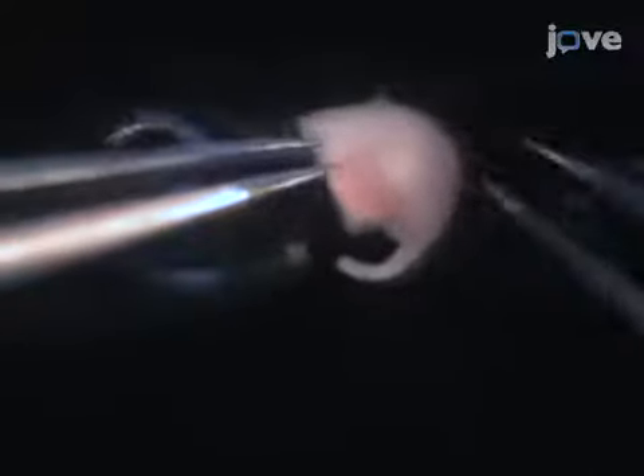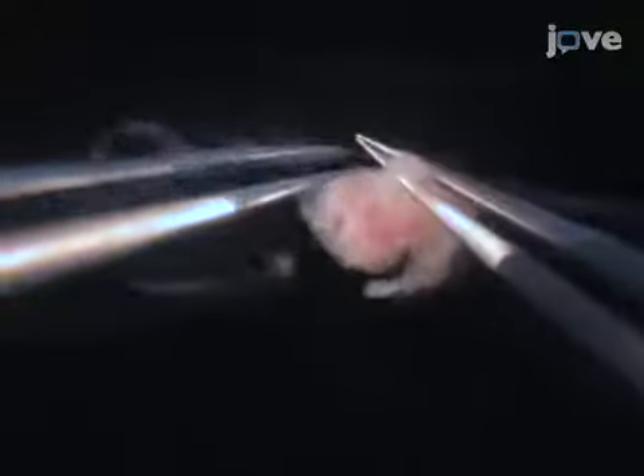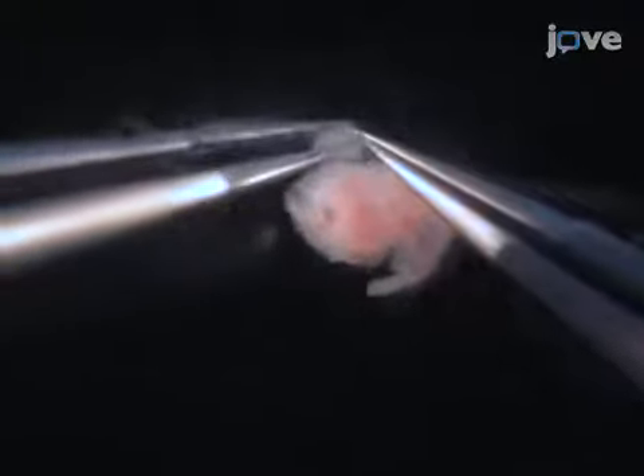Next, hold the legs with one pair of forceps, using a second forceps to remove the leg tissue. Remove the tail in the same manner.